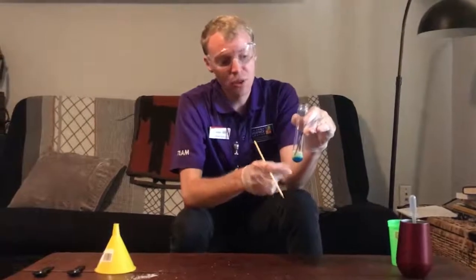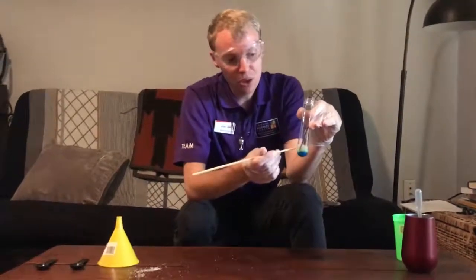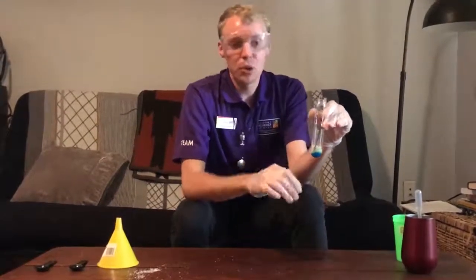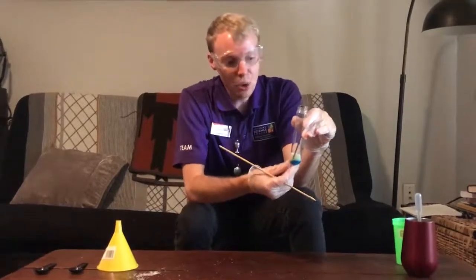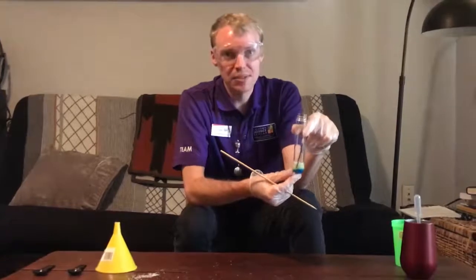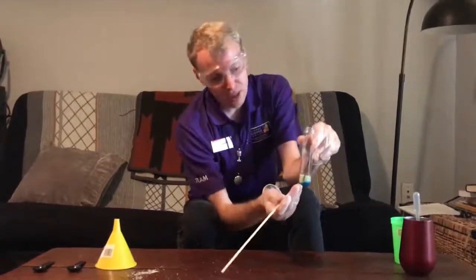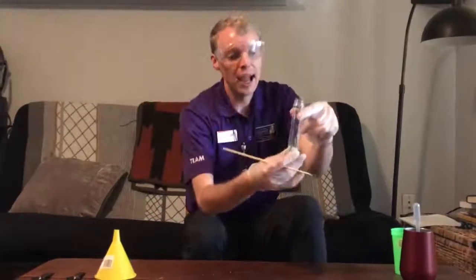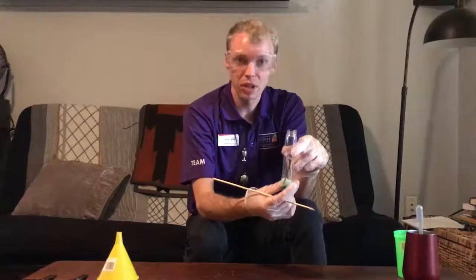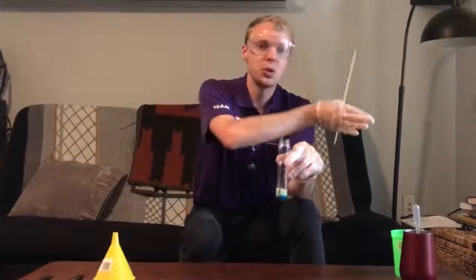And then as we go through the first cotton layer, and we get into sodium chloride, the sodium and chloride both kind of break up and split up, and the sodium is much more reactive than copper. So the sulfate gets to the second layer and sees the sodium and is like, hey, you're mine now, we're going to bond together. And that leaves the chlorine and the copper to eventually go to the other side and start to form a compound over there.